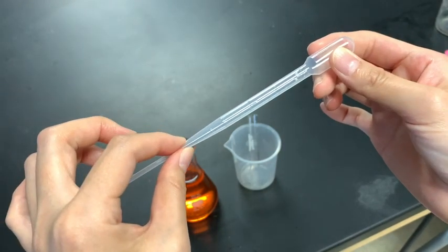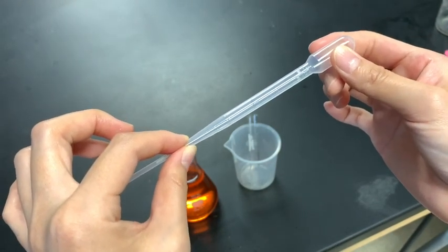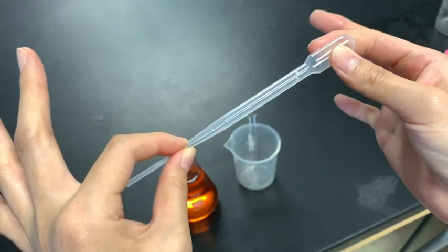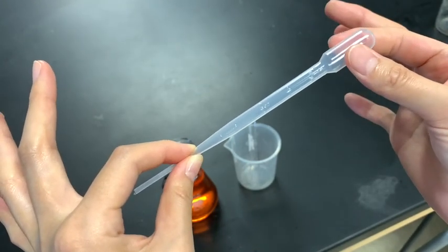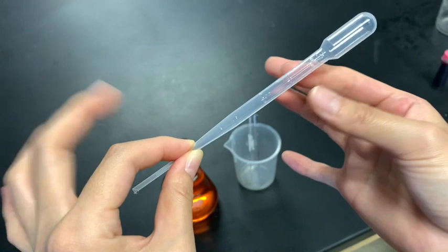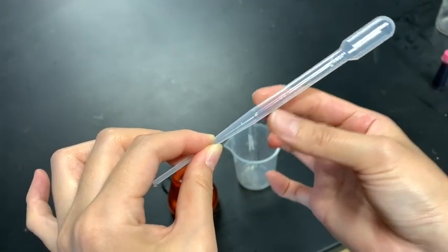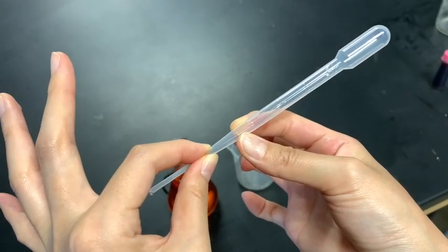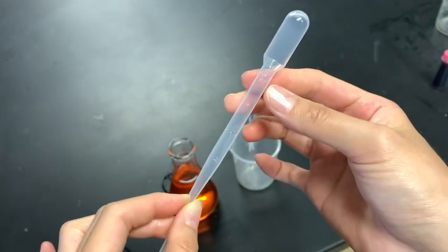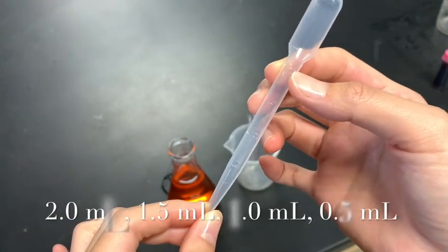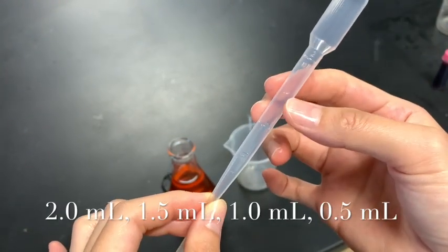In this video we're going to learn how to properly transfer solutions using a plastic transfer pipette. It is made up of a bulb connected to a shaft and all these markings on the transfer pipette allow you to measure different volumes of solution. The top mark is for 2 milliliters, the next one is 1.5 milliliters, the next one is 1 milliliter, and the last one is 0.5 milliliters.